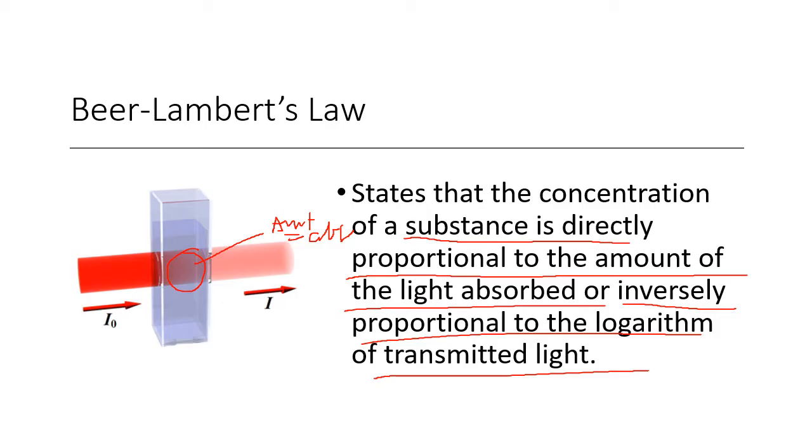So when you shine a light through that glass, a lot of light is still going to escape. And then the more you add coffee, the more you add the substance, mas magiging dark yung solution mo, and therefore hindi na makakadaan yung light. Kapag hindi na nakadaan yung light, it means that the light is being absorbed by the substance. Okay?